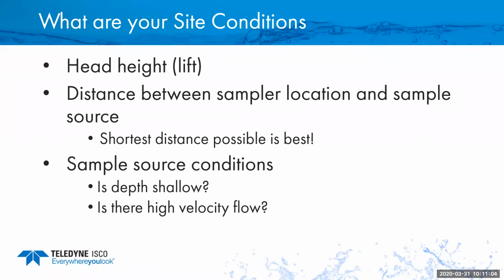If you need more than 28 feet, there are booster pump options that'll let you do vertical lifts greater than that. Basically, the booster pump will go down lower, closer to the water, and that will actually push the water up to your pump, and then the second pump actually pulls that water from there with the vacuum.